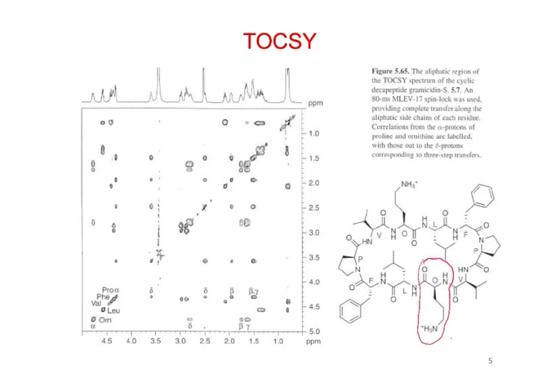this is ornithine, and it shows us over here. Here's the ornithine alpha proton, right here. This is essentially the alpha proton area, and we can go horizontally and have all of the peaks within the ornithine spin system all along this line.